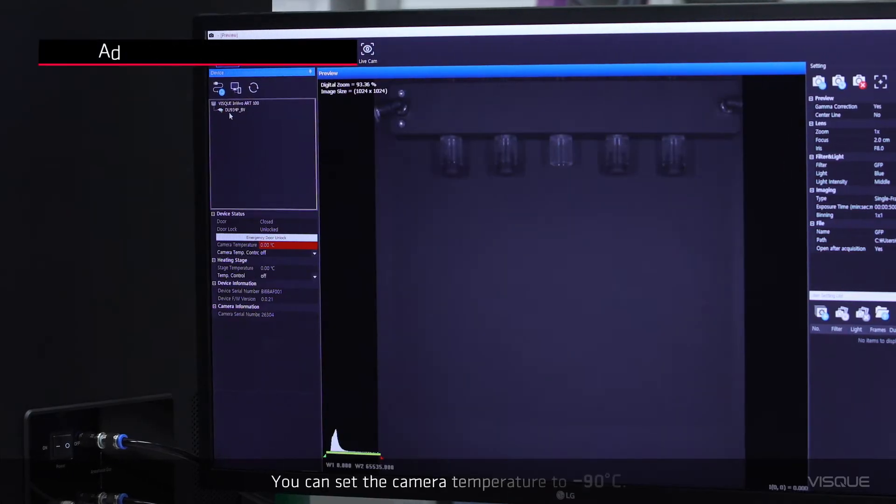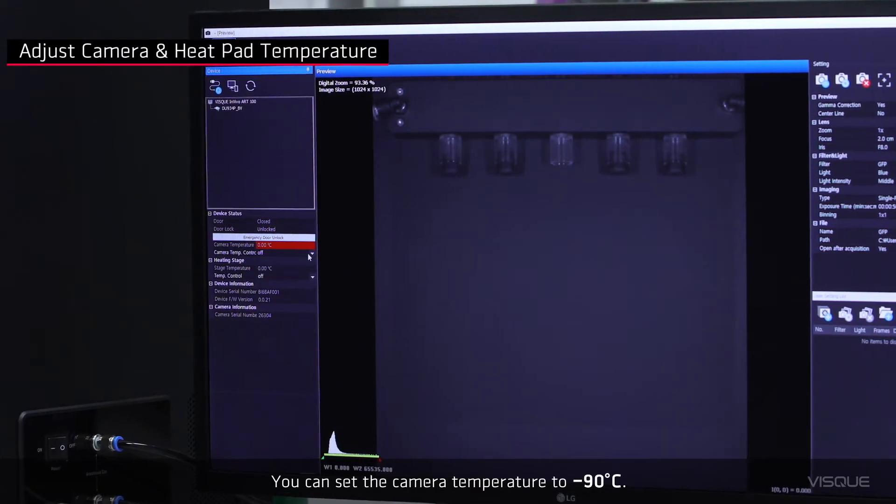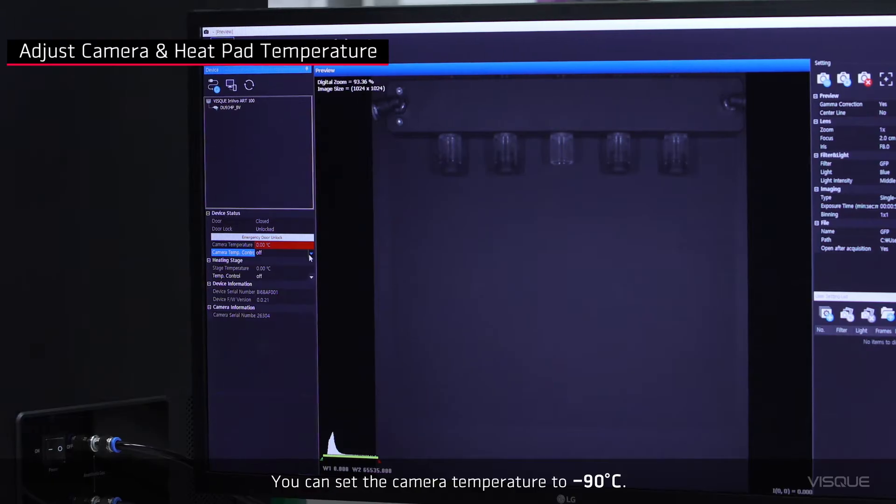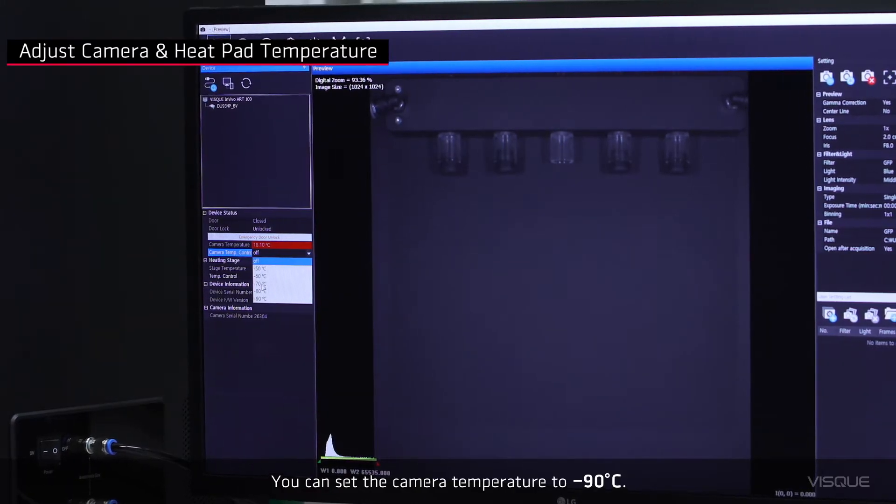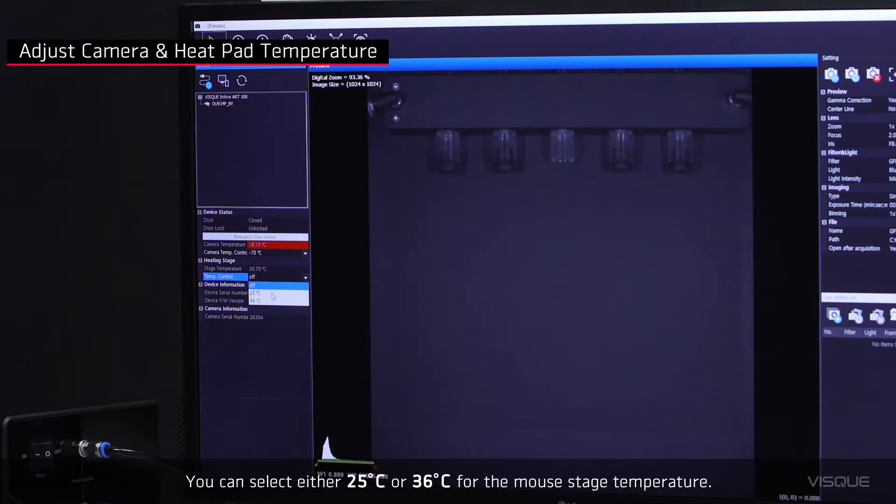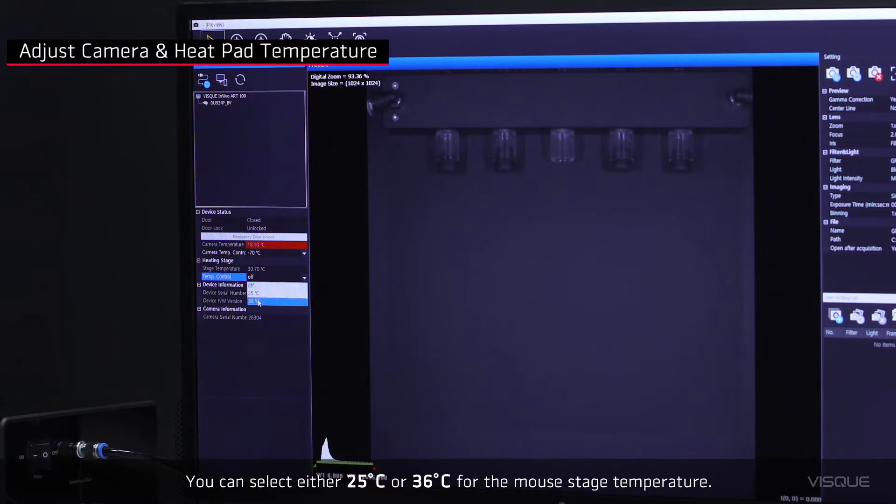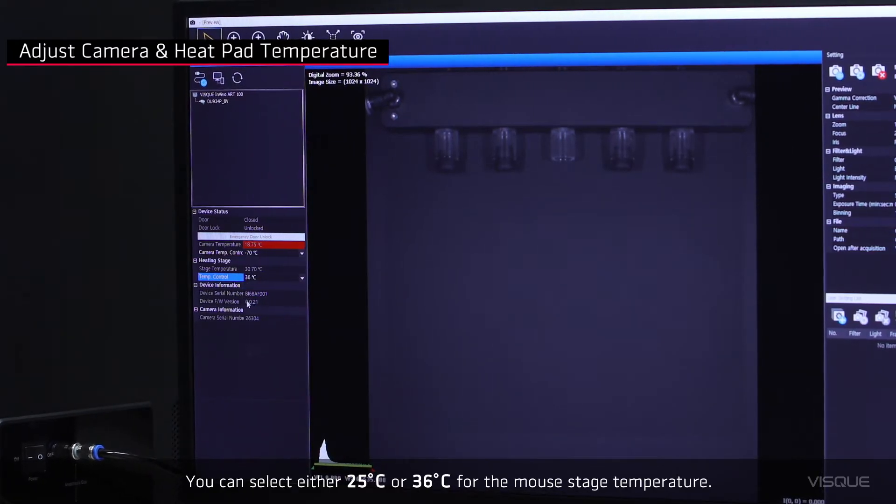You can set the camera temperature to negative 90 degrees Celsius. You can select either 25 or 36 degrees Celsius for the mouse stage temperature.